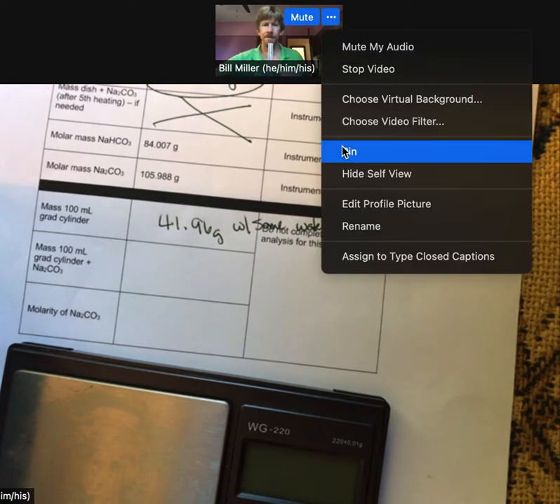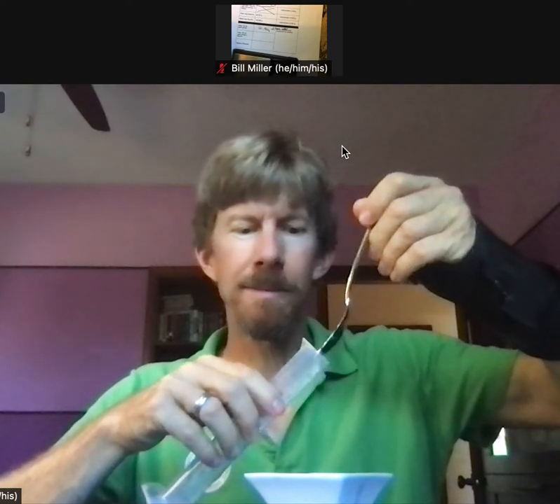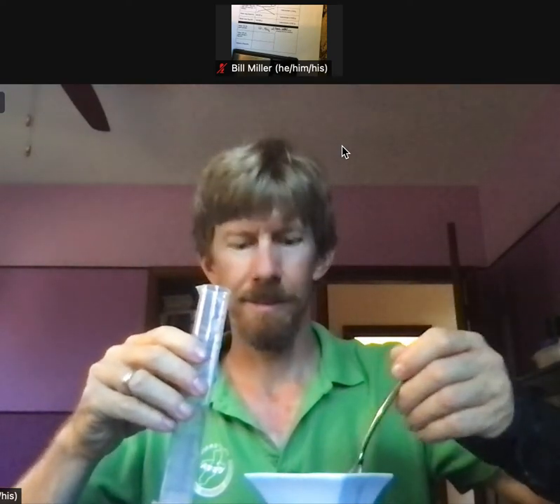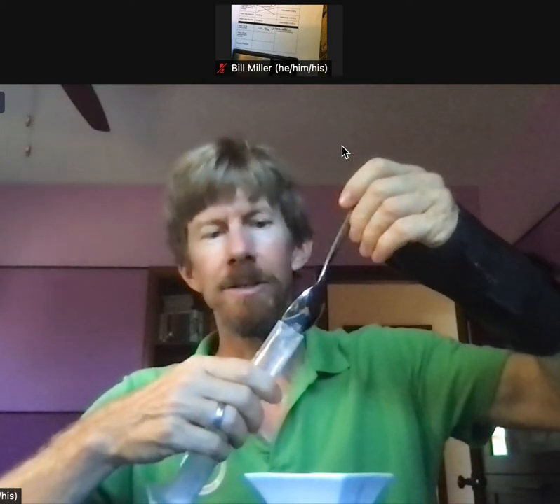It's got some water. And all we're doing is we're trying to weigh the sodium carbonate we've just made earlier in this experiment. Not sure what's the best way to do it. I've got a spoon. My spoon actually looks a little thick. I don't think I'm going to try it this way. See how messy this gets. I don't feel good about that either. Back to the spoon. Ah, there you go. Spoon fits in better that way, at a little angle with the spout.